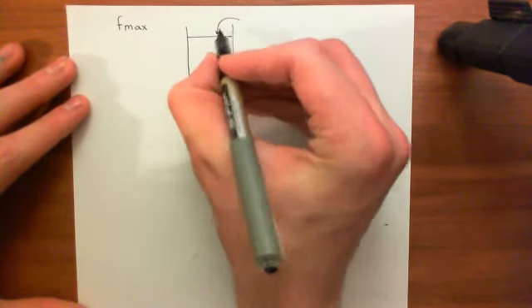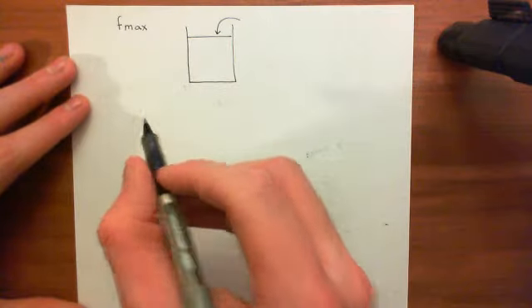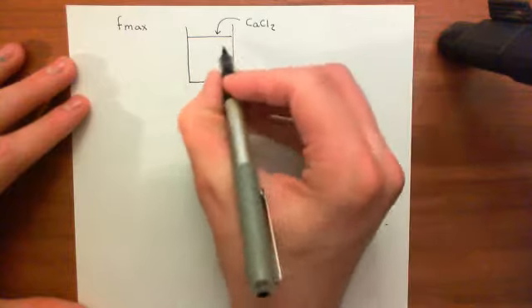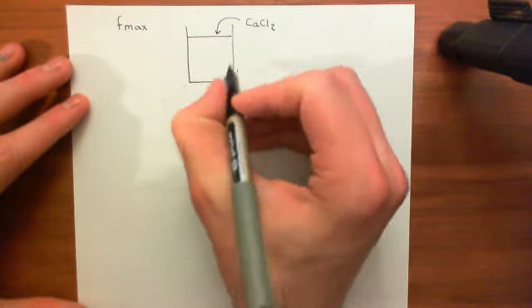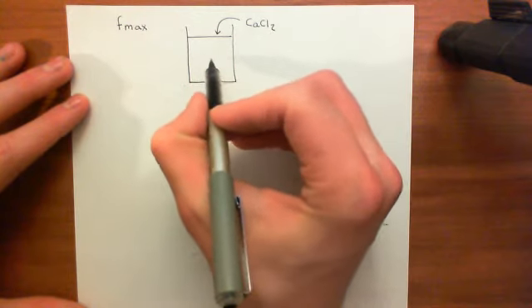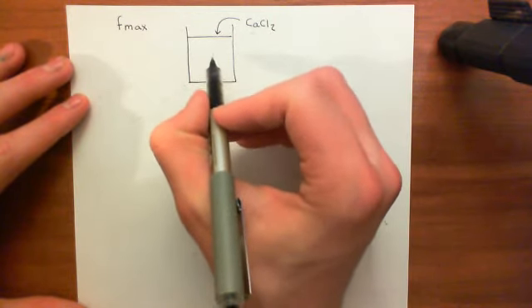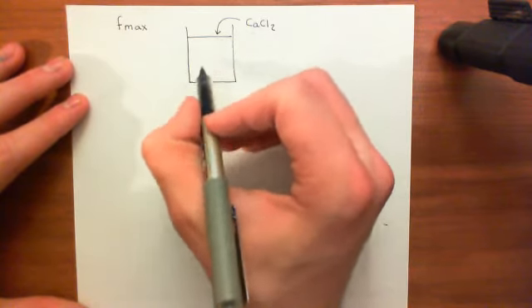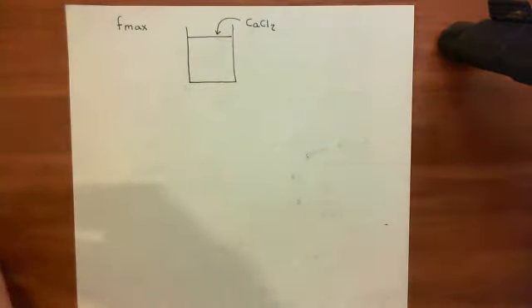So now what you'll do is you'll take the same test solution and basically you will add loads of calcium chloride. Now yes, you've added a bit of BAPTA in here, but you will add so much calcium chloride that it will completely saturate all the BAPTA that we've just been dealing with. And then it will not only saturate the BAPTA, but it will then move on to saturating the Fluo-4 molecules.